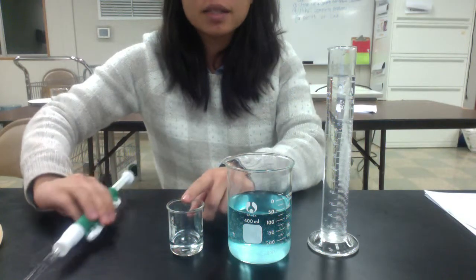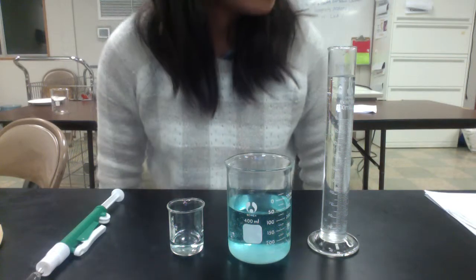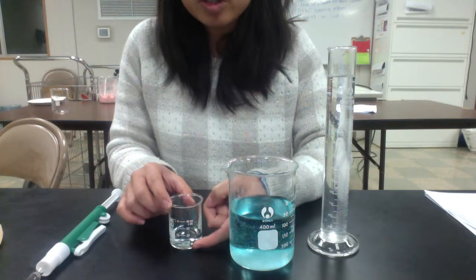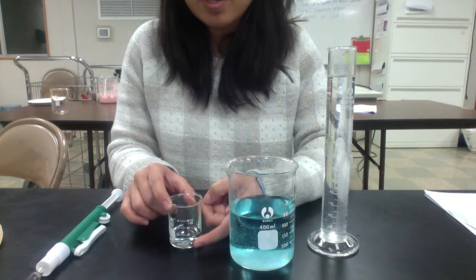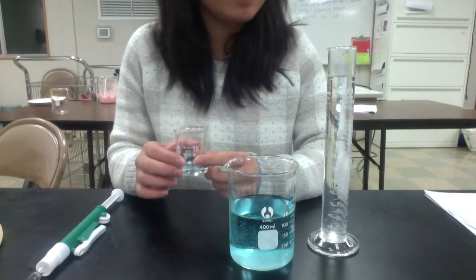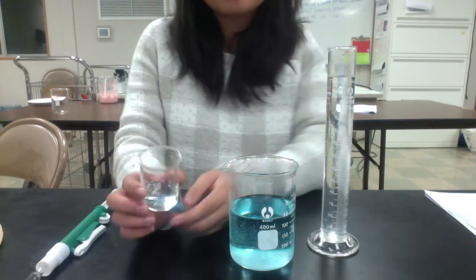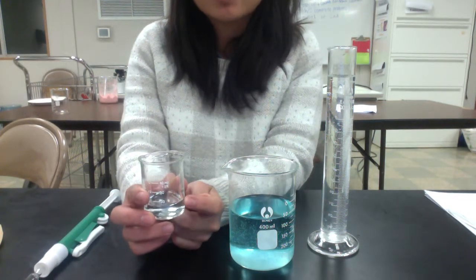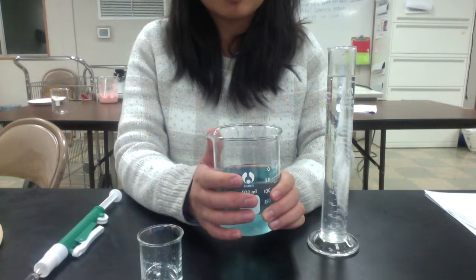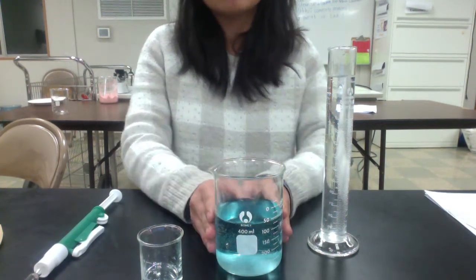Once you've done that, and you've calculated your final volume, the final volume will tell you how much volume you should have total. So that's how much you need to add until it reaches up to whatever line your final volume is. And that's how you do part 2. When you're done, you can clean this and pour this down the sink and rinse it with water. This you're going to keep in case we get to part 3. I'm not sure if we're going to get to part 3, but just keep it just in case.